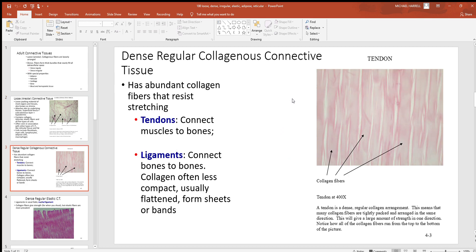Now compare the dense versus the loose tissue we just looked at. Dense regular collagenous connective tissue is very tightly packed — notice you don't see nearly the space between these fibers like you did in the last ones. Regular means they're pretty much all oriented in the same direction, and collagen is the dominant fiber. So it gives a large amount of strength in one direction. Remember, collagen is like little steel cables — very strong. Good examples of where you find this tissue are tendons and ligaments, which are structurally the same thing.